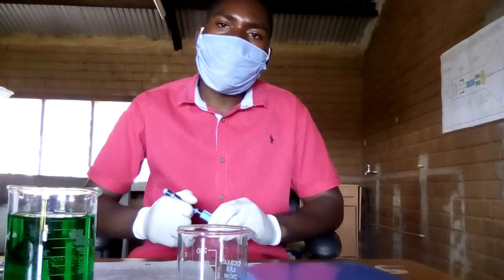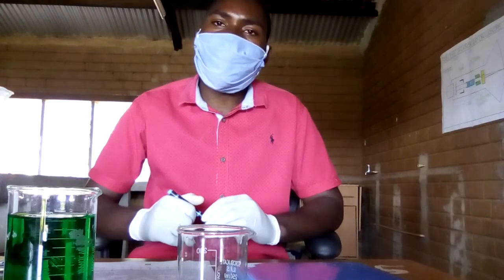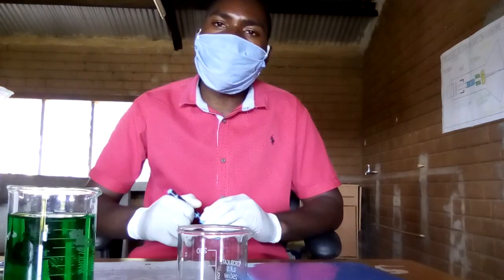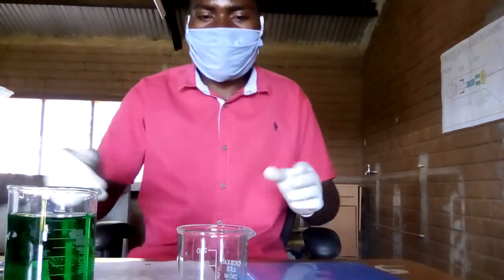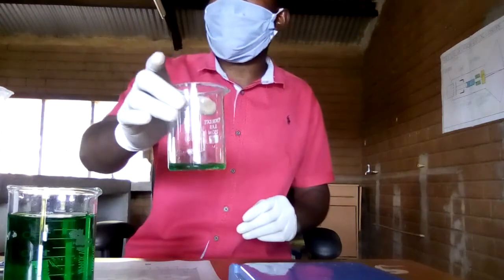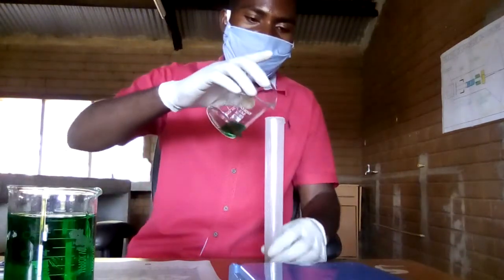Once you have done this, you need to repeat this experiment for different volumes of liquid P. Different volumes such as 20 cubic centimeters, 30 cubic centimeters, 40 and 50. That's where we are ending. In order to do that, I'm going to do the same. I'll pour this 10 cubic centimeters back into the measuring cylinder. And this is what I've done.